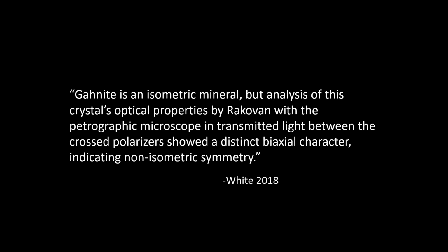When placed under the cross-polarized light of a petrographic microscope, the gahnite was not only birefringent, but it displayed a particularly strong biaxial interference figure, which we usually only see in crystals belonging to the orthorhombic, monoclinic, and triclinic classes. These were the findings that we sent back to White, who reported on them in a June 2018 issue of Rocks and Minerals magazine.